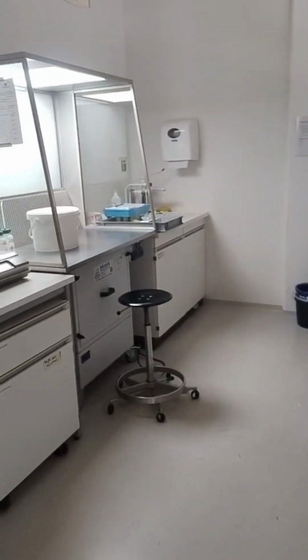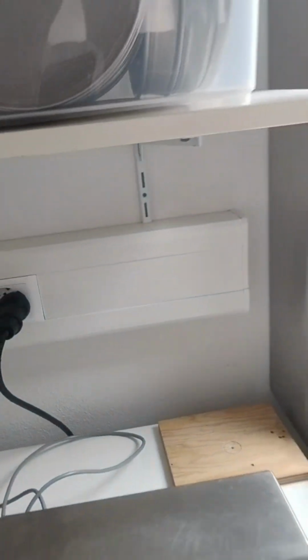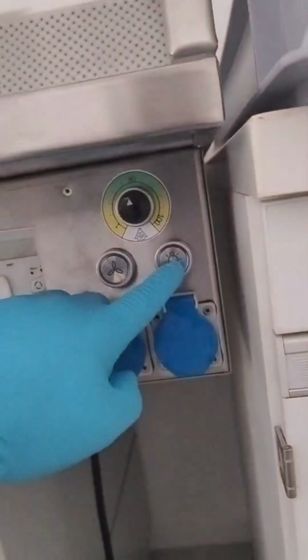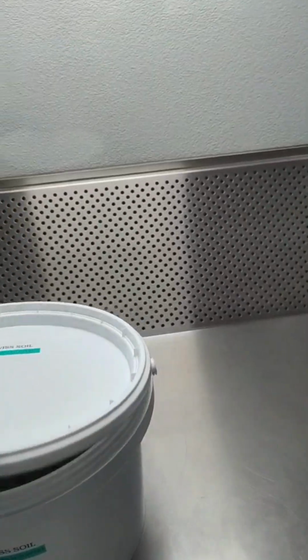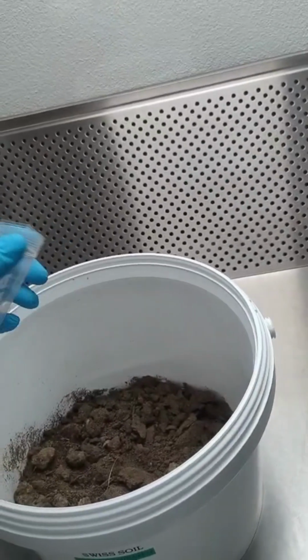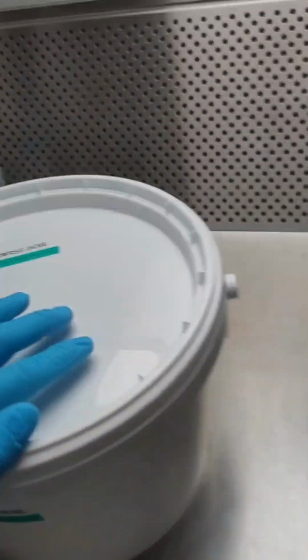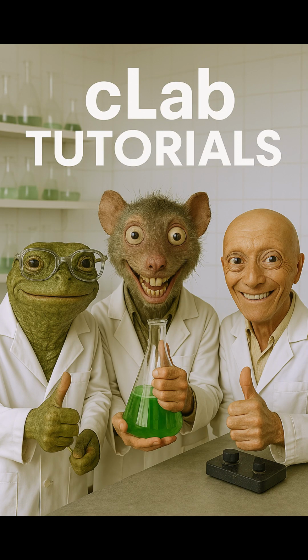To protect yourself and others, soil must always be disposed of under the fume hood. Before you start, plug in the hood and turn on the light and ventilation using the switches underneath. Then take the correct bucket, place it inside the hood, open the lid, and dispose of your soil samples carefully. Once you're done, close the bucket tightly and switch off the hood again and return the bucket to its designated place. That's it for part 1 of our waste disposal guide.